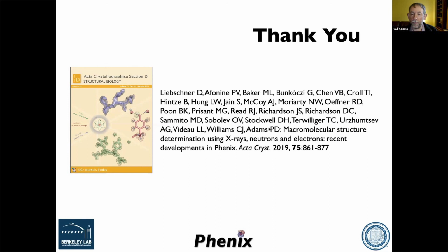I guess, are Cryo-EM maps generally lower resolution? So currently I would say that is true. If you looked at that distribution in crystallography, the typical resolution for a crystallographic experiment is around 2 angstrom. And that is not the typical resolution in Cryo-EM.